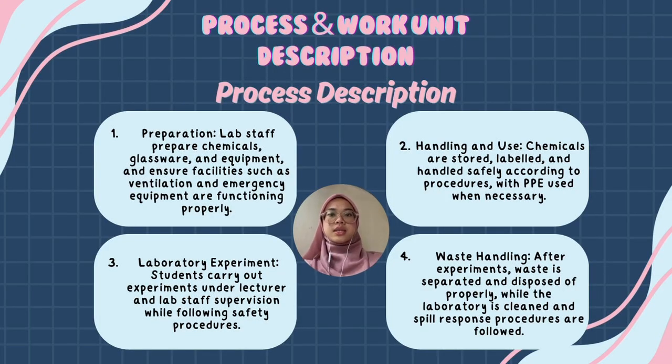The second step is handling and using the chemicals. The chemicals must be stored in suitable containers and labeled correctly. Before use, the lab assistant identifies the possible hazards and follows the safety procedures. They also wear the appropriate personal protective equipment or PPE, such as gloves, safety goggles, and masks to reduce the risk of chemical exposure. Next is conducting the laboratory experiment.